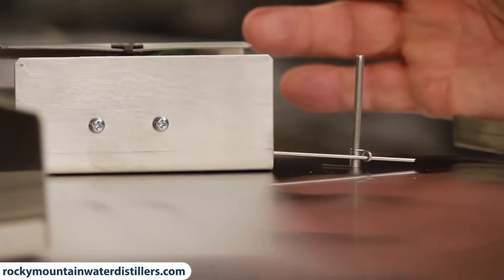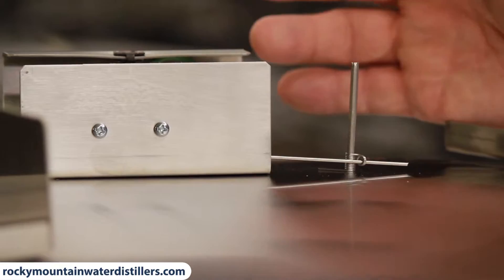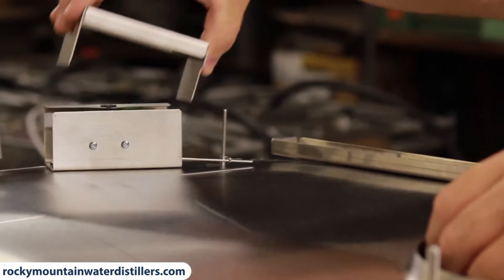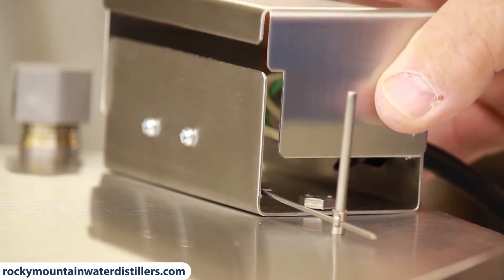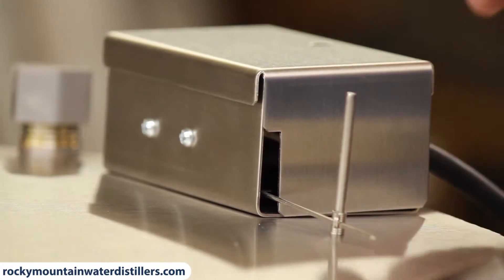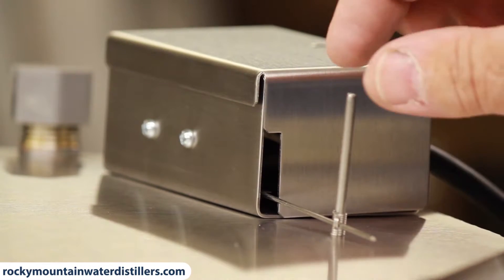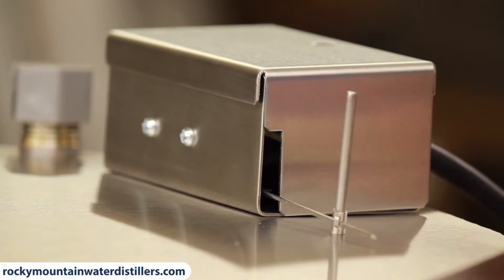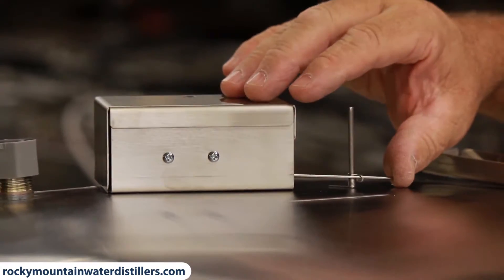It's kind of a preference of how full you want to run your distiller and your tank. I like to keep it as full as possible because the less air you have in the tank, the better off you are. You finish by putting the cover on the electrical box. Slide the top on and put the Phillips head screw in there. This slot needs to be showing so the switch will go up and down freely and shut off and on. That's how it operates when you're finished.